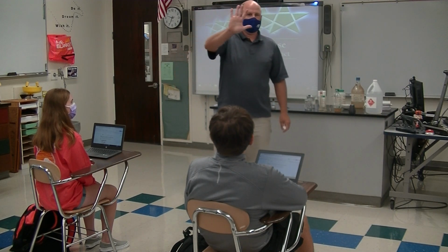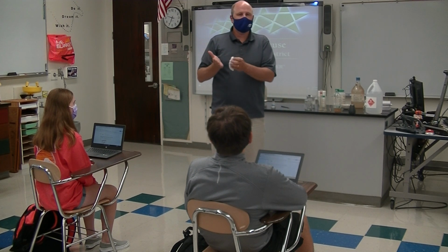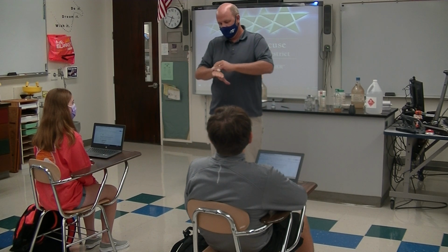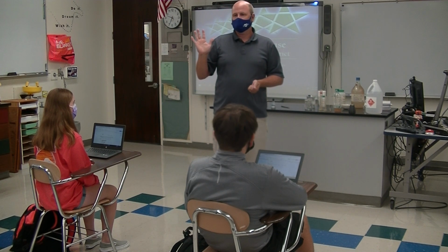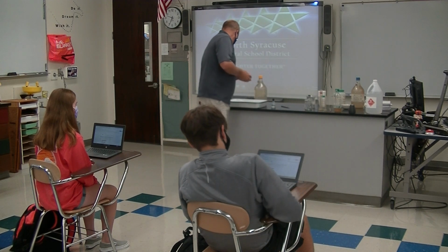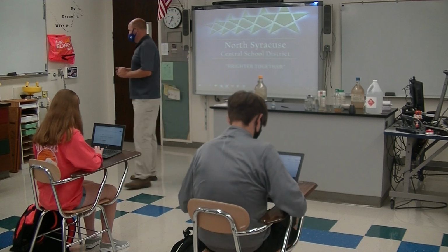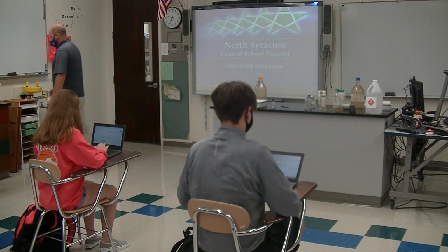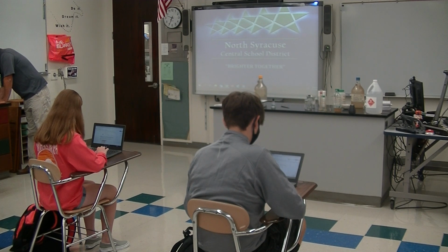Did it do anything to my hand? You can see a really light thing in here. It did peel off a couple layers. It's a chemical peel, if you guys have ever heard of such a thing, but it didn't make any lasting effects on my hand. Still had plenty of time to deal with it. So treatment, you're going to wash with water. If it's on your hand or your face, you're going to use the sink. You're going to flush with water or rinse with water in the sink.